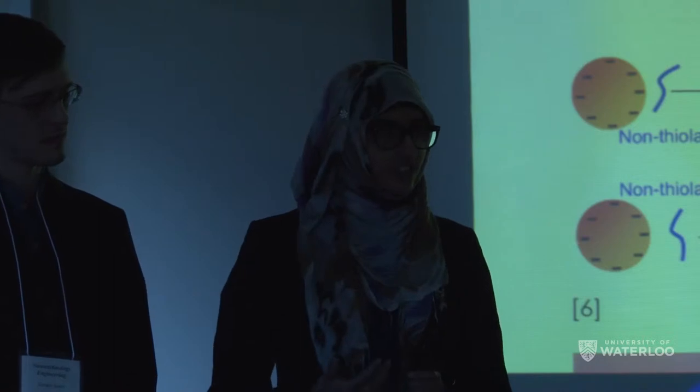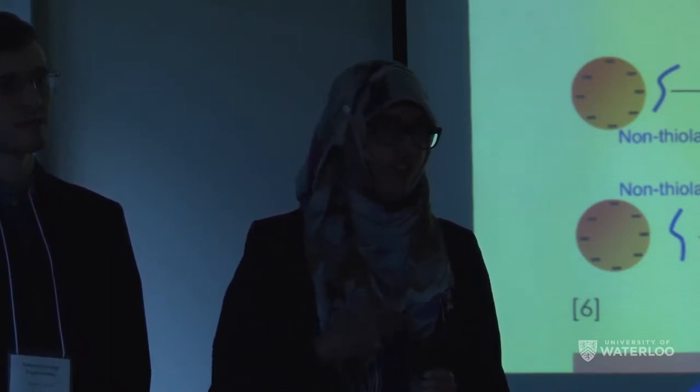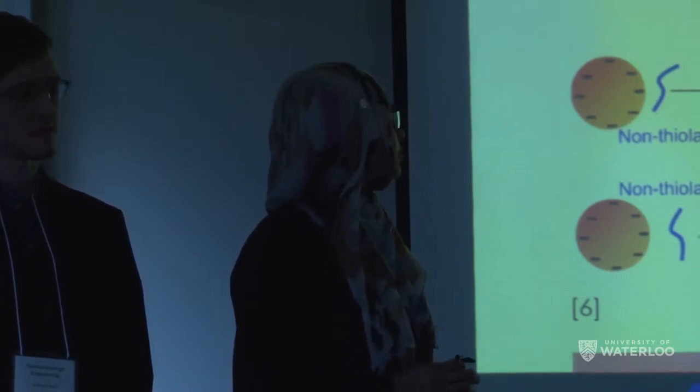You get a really good surface coverage and a lot of free aptamer space so that you can actually have binding to your target analyte. This process takes at least 10 hours, a little bit more than that.